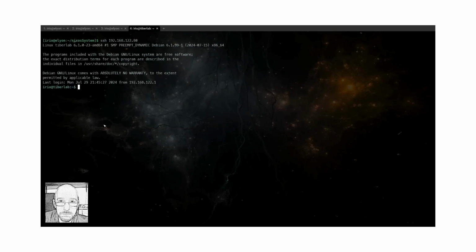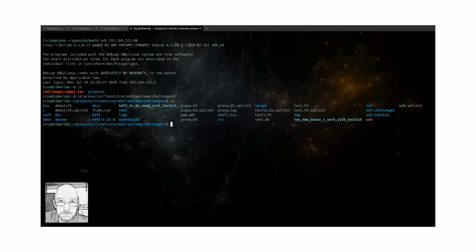And if I click on the meta file, it shows the same thing we were seeing in the JSON file, but this one is extracted by calling a REST API on the system. So it gives access, of course, to the same data, but the way it gets retrieved is different.